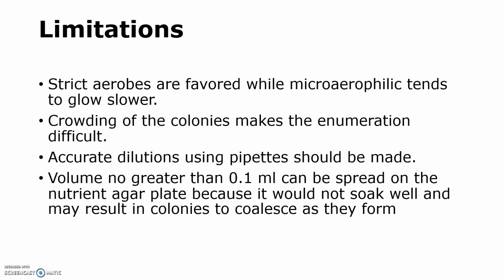A volume not greater than 0.1 ml can be spread on the nutrient agar plate because it would not soak well and may result in colonies coalescing as they form. So if we spread more than 0.1 ml, it would not soak well and it may result in thickened, heavy colony formation, which may coalesce as they form.